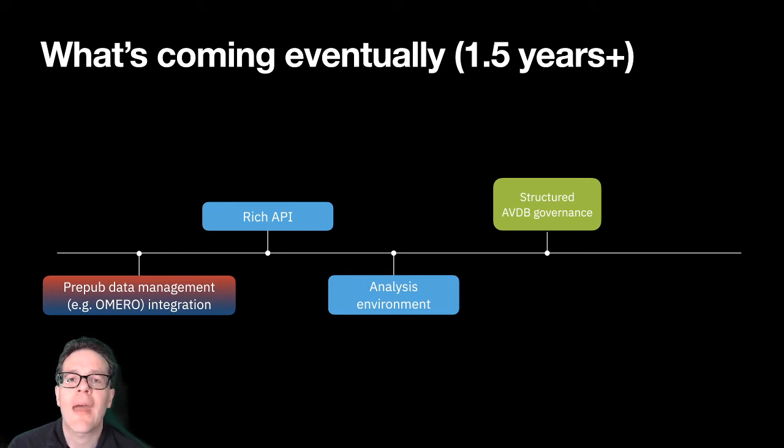Another thing that we'd like to do once we're in a position to be able to do internal conversion of images is to offer out those converted images in the form of a rich API, so that, for example, you can get individual planes of three-dimensional images, you can get time points from time series, you can get some of the embedded metadata in those images.